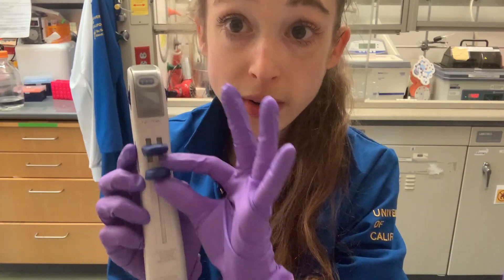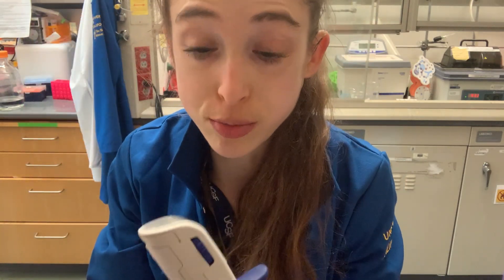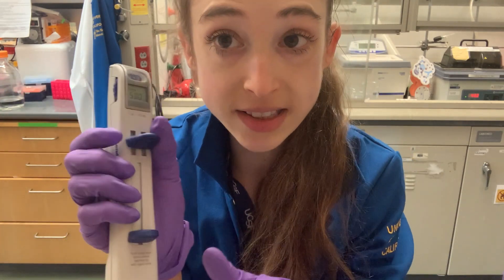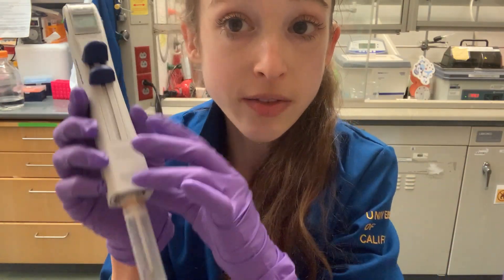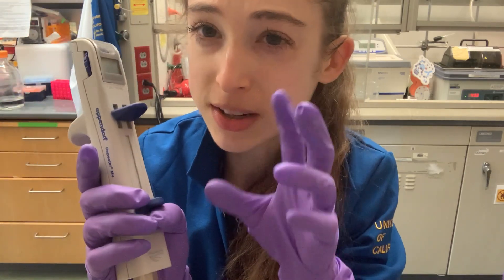The bottom lever pulls liquid up and pushes it out freely — without step sizes — just based on how much you pull and push. The top button is what delivers the set step sizes, the individual portions. I recommend refilling before you get to the last aliquot, because the last one is often a bit off due to air or bubbles. Aspirate a bit more than you need and it'll be fine.